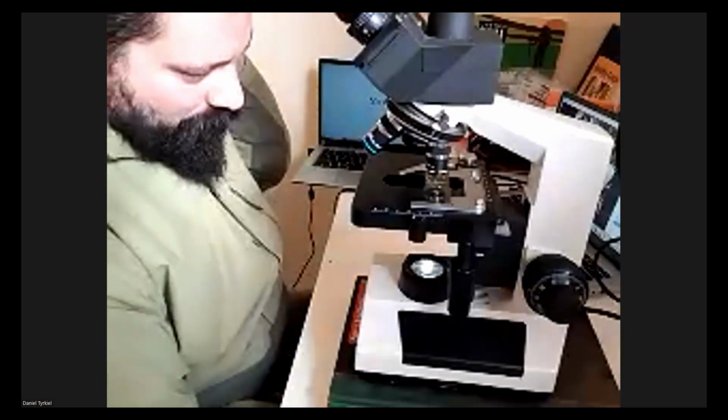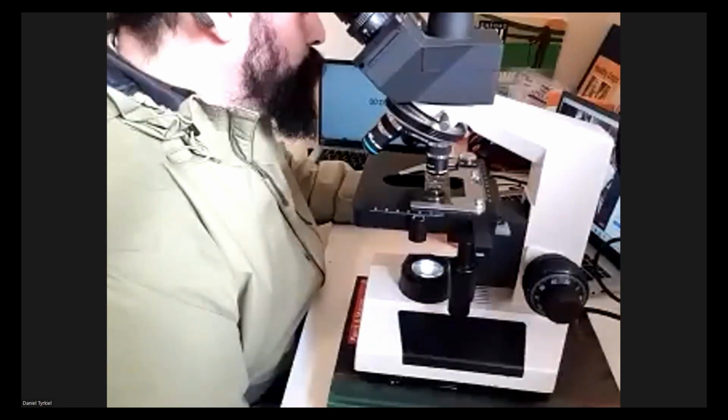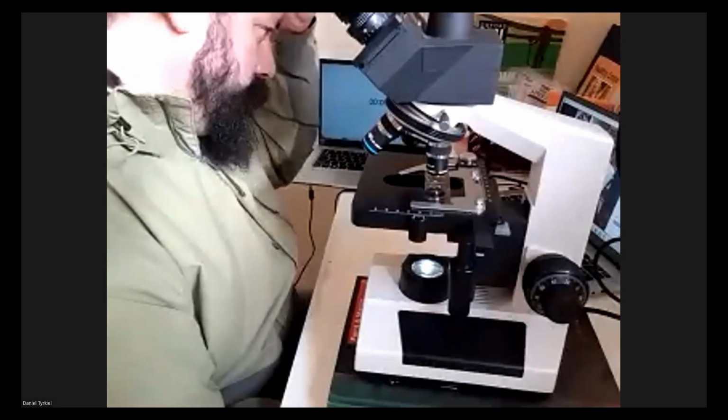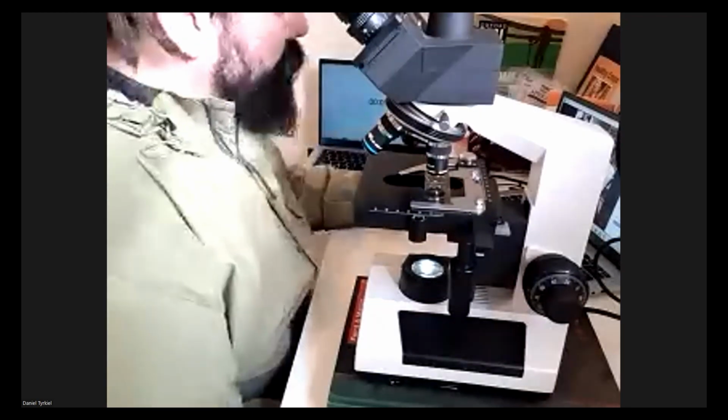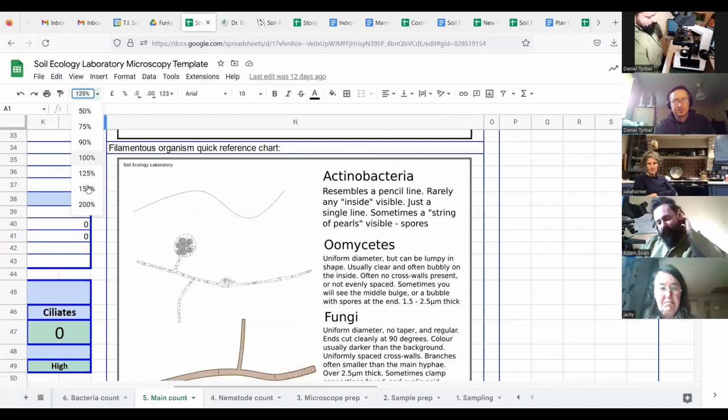Interesting. If everyone saw that key with the beneficial fungi there, do you want to quickly show everyone that again, Daniel? Yes, 1 second. Can I increase the size as well? It's a good example of an organism that's easy to show everyone on Zoom.